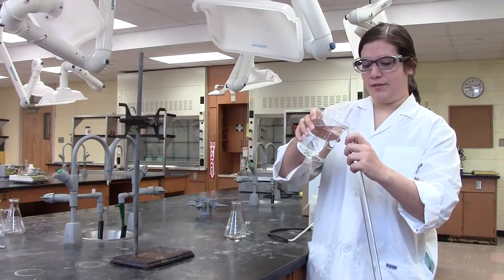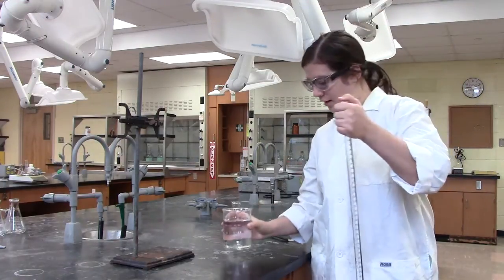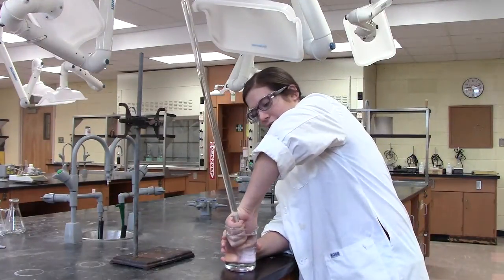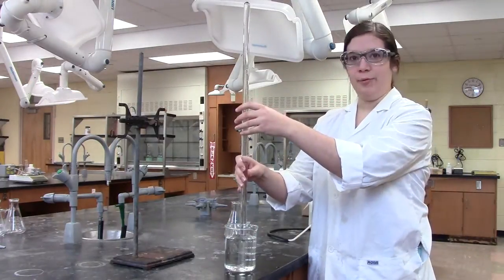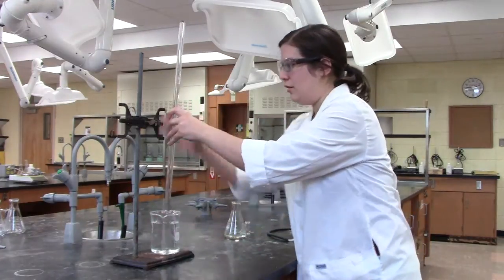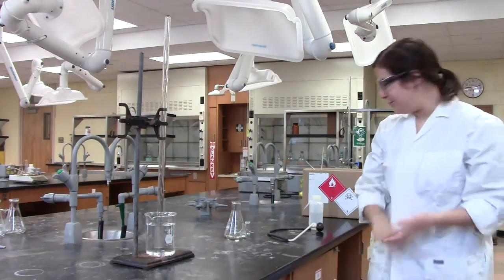To fill your gas buret with water, first you just dump some in. And you want to make sure that it's full all the way to the very top. Then use your thumb to cover the hole, flip it over, and put your hand down into the water, and then release. Make sure that the end of the gas buret is completely underwater before you remove your thumb, and that will ensure that there are no air bubbles. Attach your gas buret to your buret clamp, and then that's ready to use.